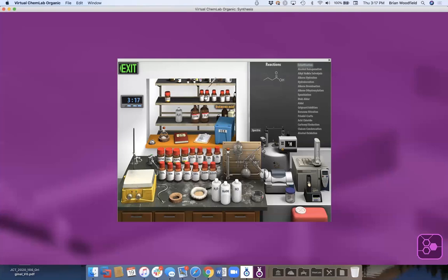So, if I picked just another acid and I did some reaction, then that's what you would see the reaction happen for 2 different acids. So you are allowed to have 0, 1, or 2 of these reagents. If I pick this alcohol and then I add it, then I'm going to see my mixture. Now I can add, although I don't have to add it in this order, it can be any order that you do it, my solvent or not add a solvent. So I don't need a solvent for this.